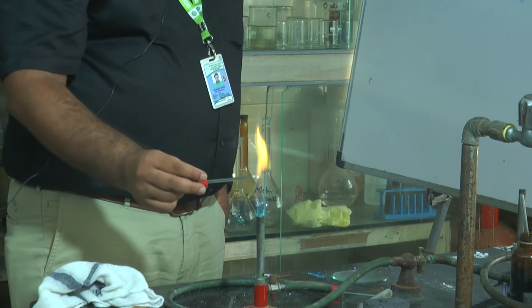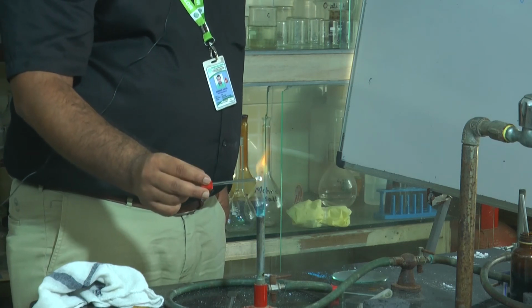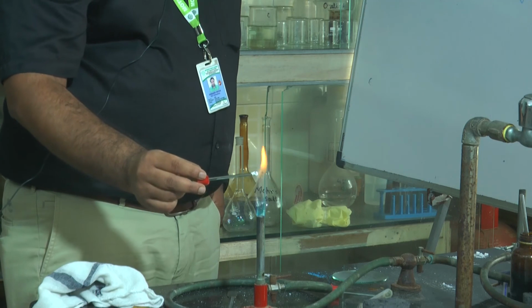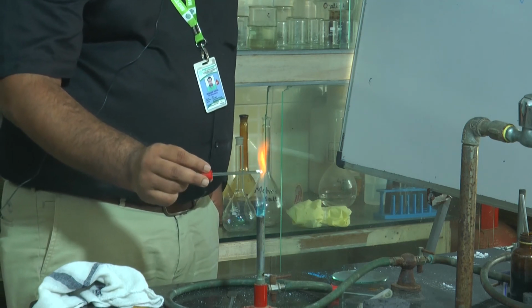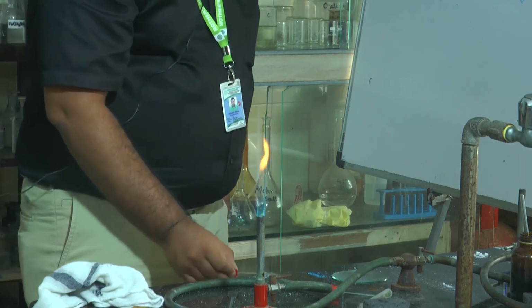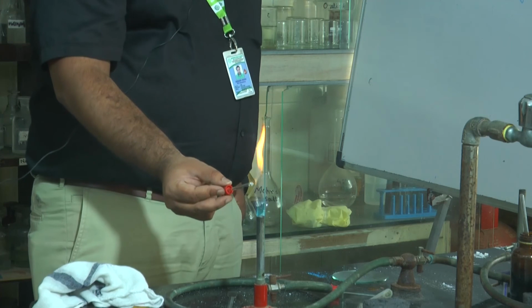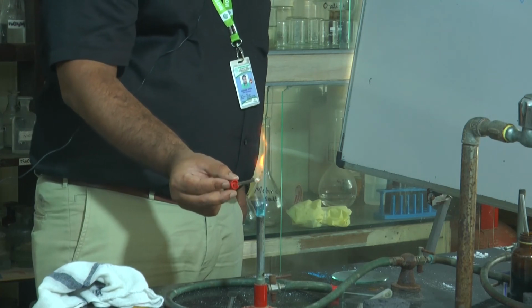So see this one, which color? It is coming green color, slightly green. In between you can see green color. This green color that is coming means barium. If you observe green color, that is barium. See, I am showing again. You can see the green color. Green color in the flame is barium.